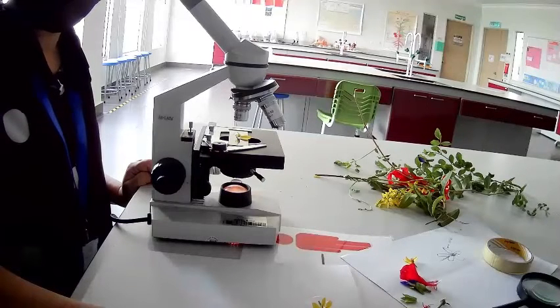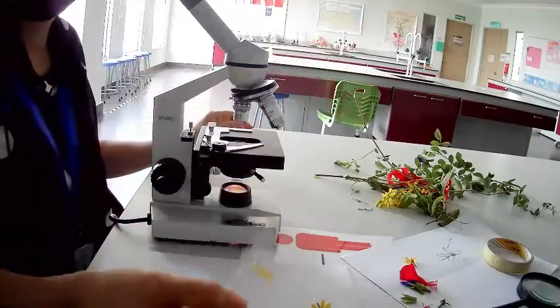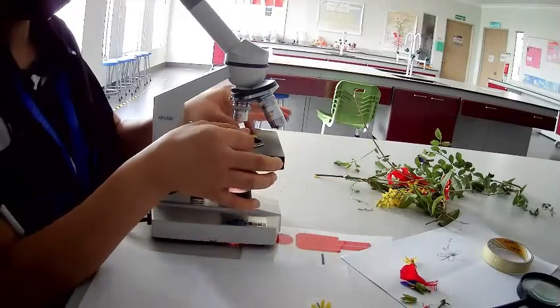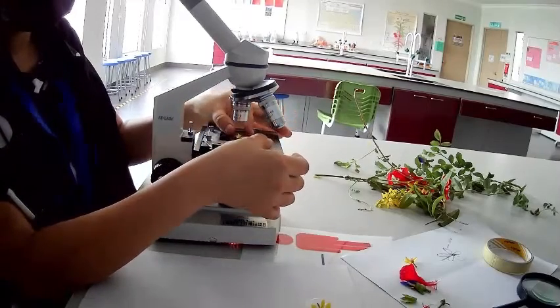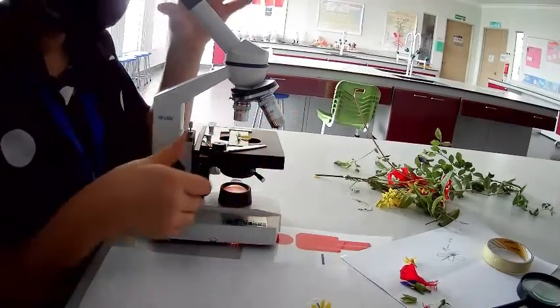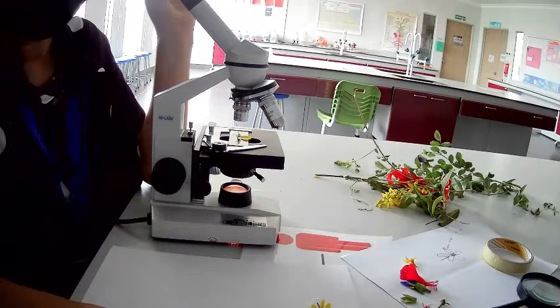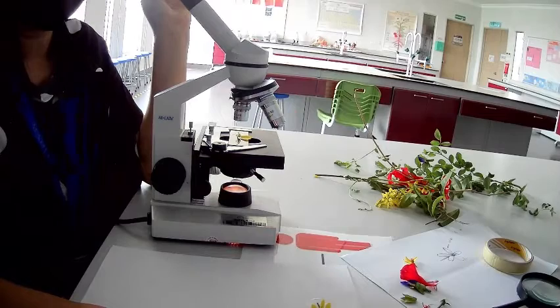As you can see, I have mounted the flower on this slide. To watch under the microscope, I'll remove the petals because I don't want them. I only leave one petal on it. I just want to see the different structures first, and little by little, I detach each of them and watch them separately under the microscope. First, I find the male part and female part and the whole thing, and then take one of these stamens, the male part, and look at it individually, separately under the microscope.